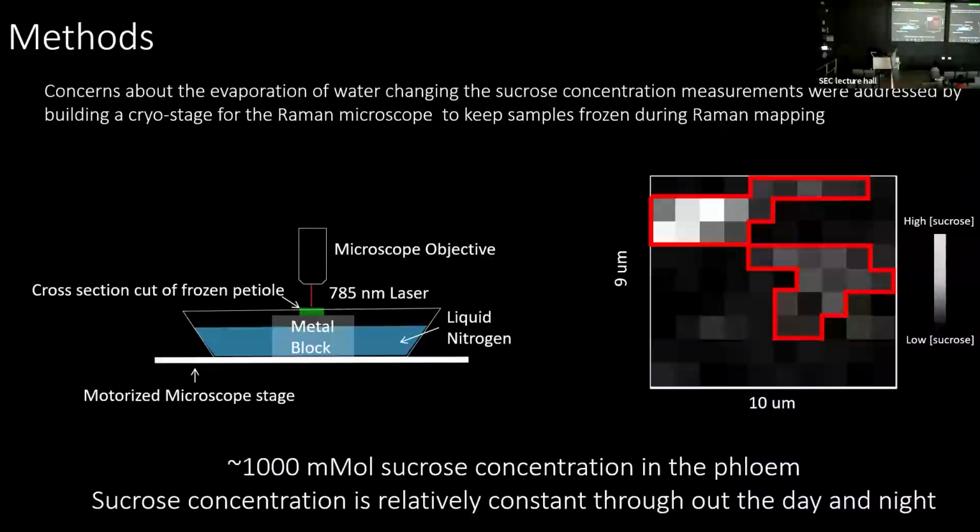And then here's combining, this was a botany project that came through, which was interesting. A group wanted to know what the sugar concentration in a red oak leaf was across a 24-hour cycle. So plants make sugars by photosynthesis. What happens at night?